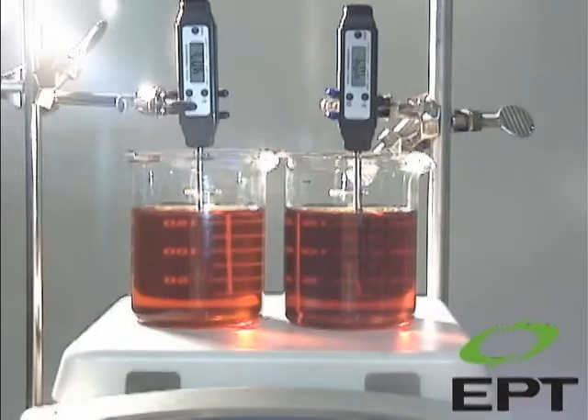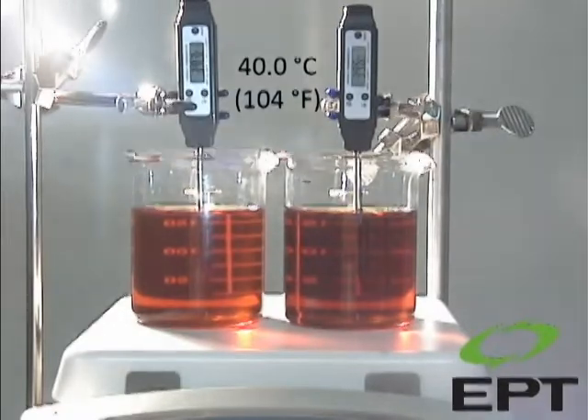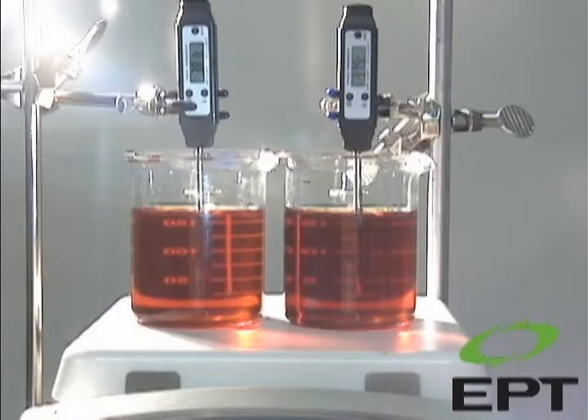Both samples have been heated to 122°F to emulate normal fluid reservoir temperature. As you can see, both samples are visually identical and clear.